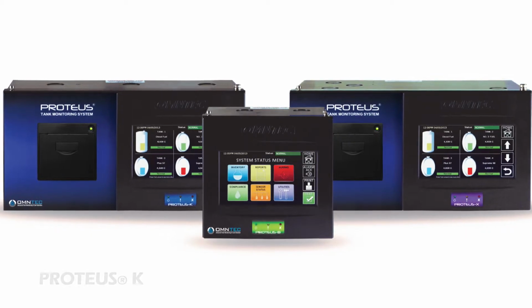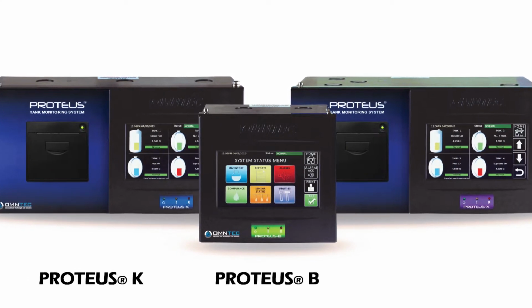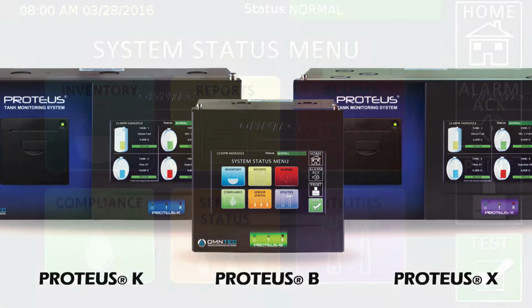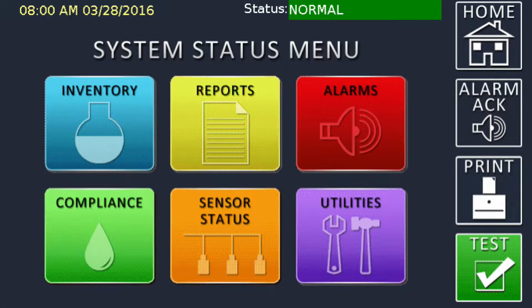This presentation will outline some system troubleshooting techniques and the use of the diagnostic features of the PROTEUS controller. The main menu will allow you to navigate to the PROTEUS diagnostic functions through the Utilities sub-menu. Press on the Utilities button.